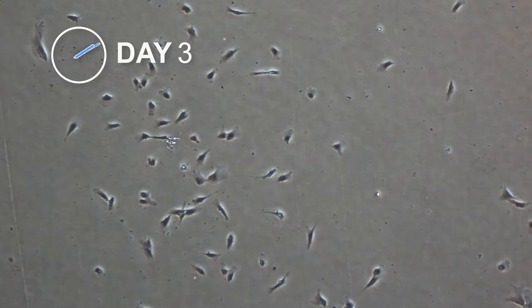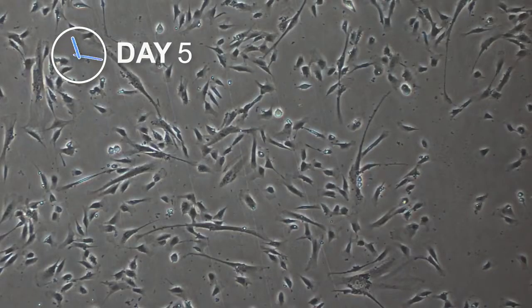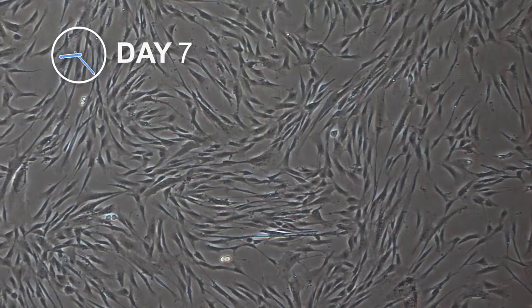Production volumes are more than triple that of flat cell culture systems, consequently solving production shortfalls.